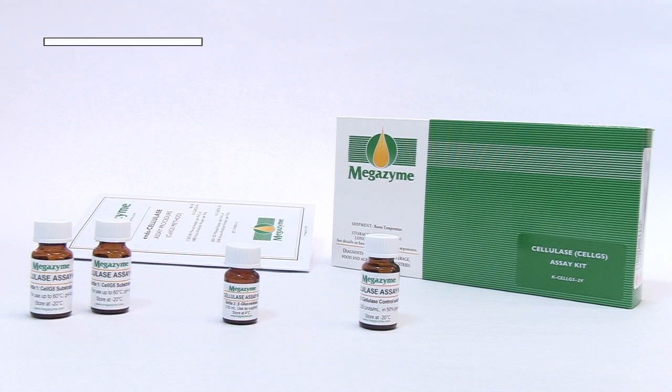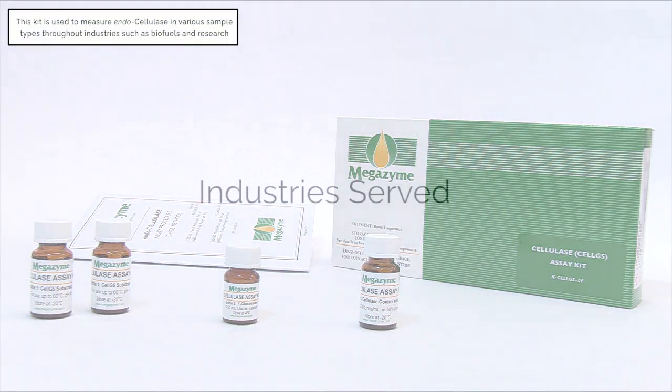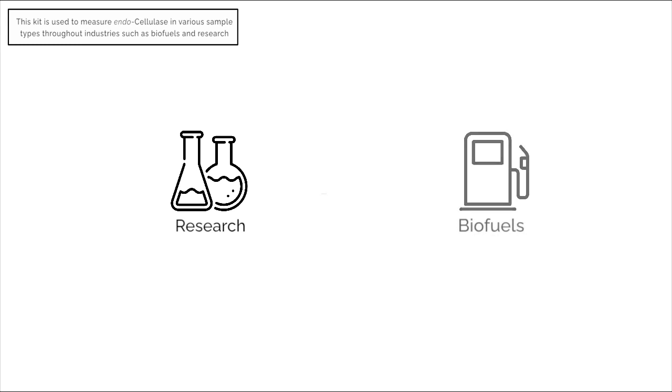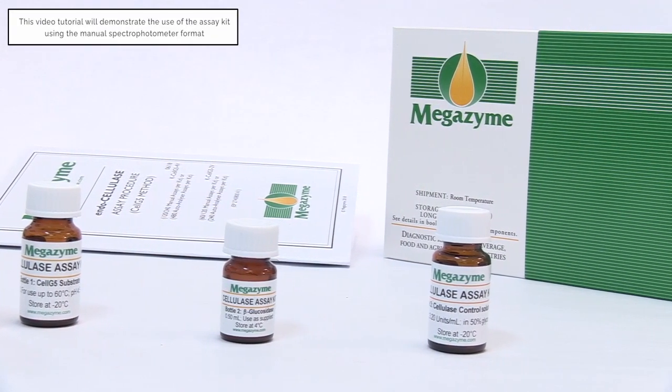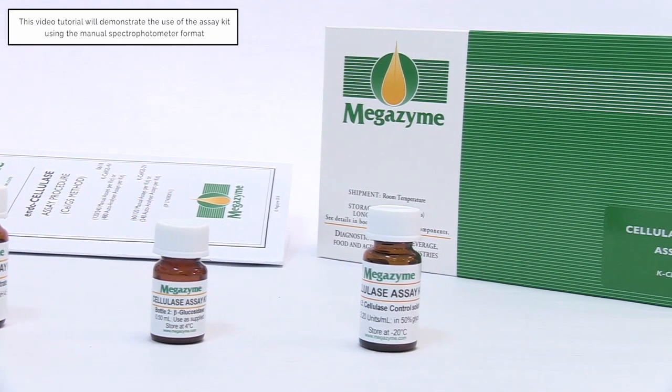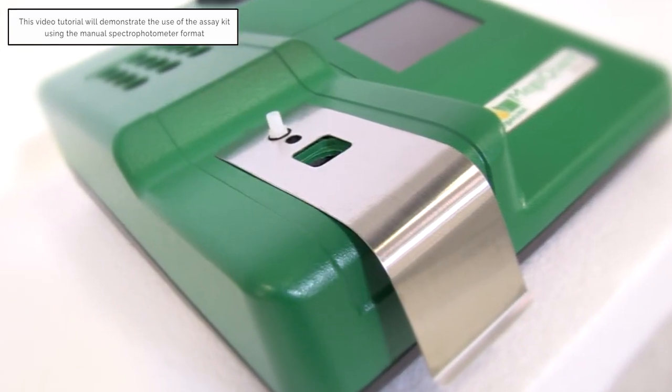This endocellulase assay kit can be used to accurately measure endocellulase in various sample types throughout industries such as biofuels and research. This video tutorial will demonstrate the use of the assay kit with a grain sample and the kit standard using the manual spectrophotometer format.